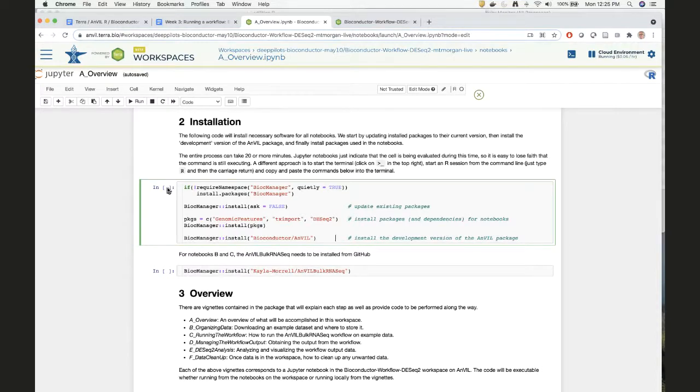So I wanted to see the packages being installed, because it'll make the time go by faster. So I'm going to copy this stuff, drag over and Control C, and then go up to this little icon at the top that says Open Terminal.